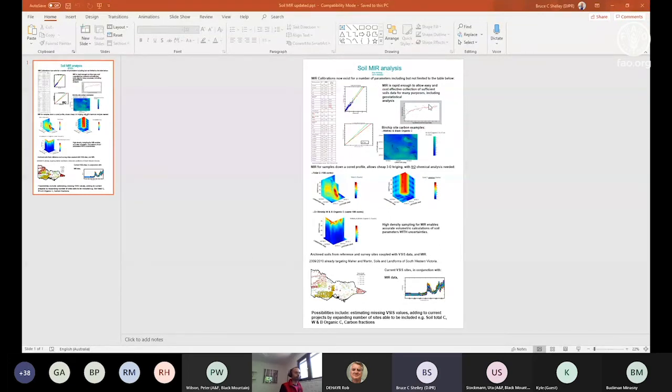What are we doing with research? We use MIR a lot for site characterisation to optimise the actual sample points in our trial sites. We are also using MIR on cores, predominantly using, well, the handheld is a work in progress. We don't actually generate data off that for projects. When we do cores, we actually cut them up, bring them back to the lab, prepare them fine grind and run them that way. And we use that for doing 3D kriging for our 3D soil maps.